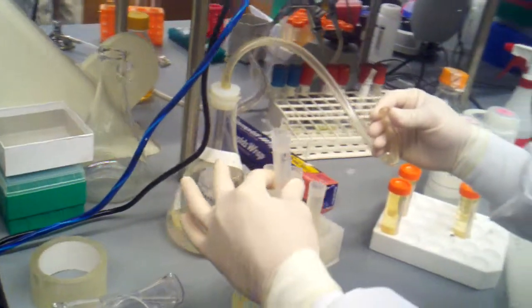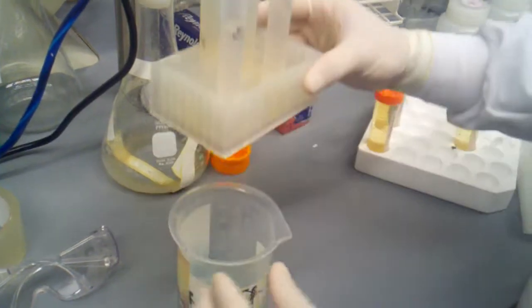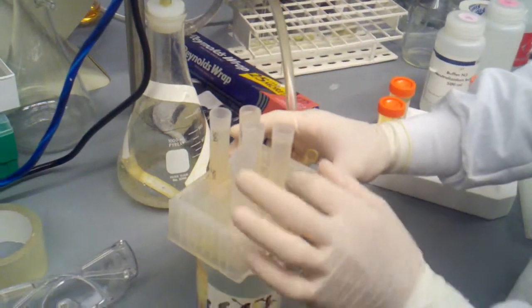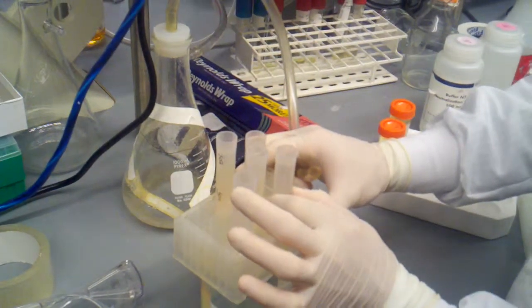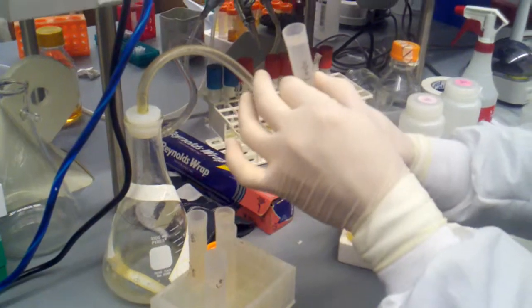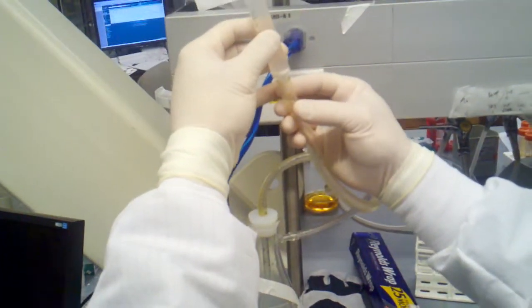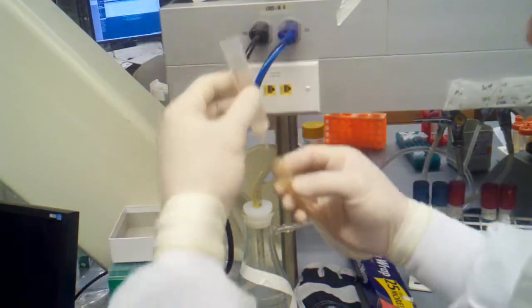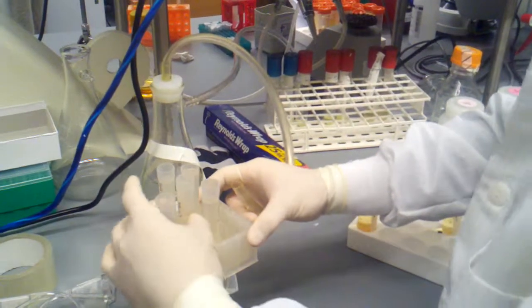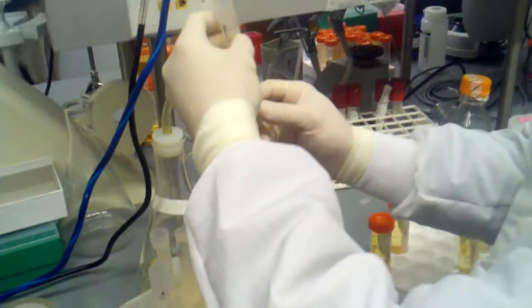I'm going to drop it. You can see it's dropping pretty quickly. I'm going to put it back into our 24 well block, and I've drilled holes in here so it can just flow right out. I'm just going to do that same for the rest of them. You need to be careful here because it's kind of precariously balanced. It'd be really easy to knock everything over and lose all of your samples. Again, I don't try to seal it completely because that might mess up how it settles and flows. So, got a couple more here.